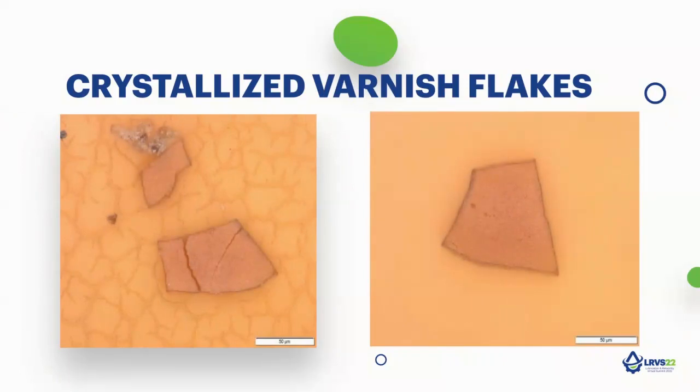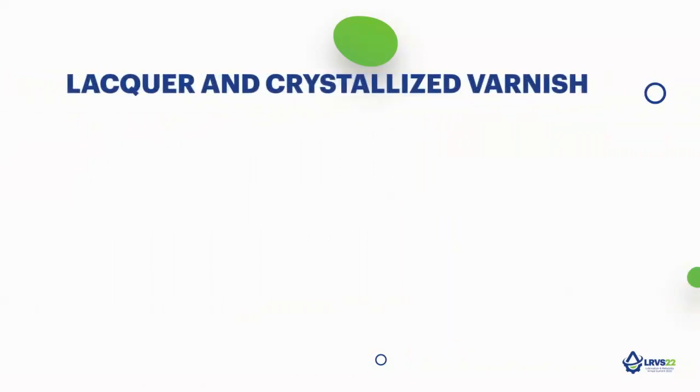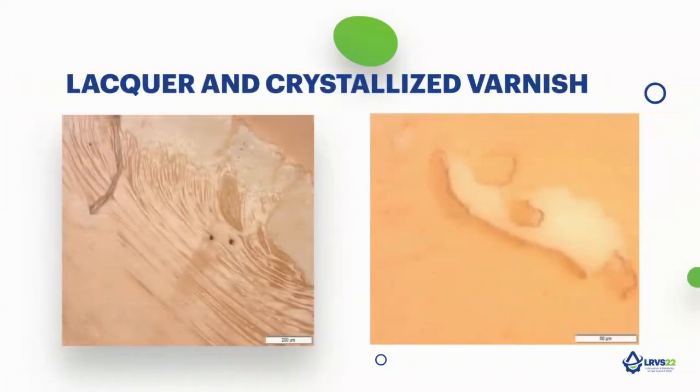As you can see, the image on the left has a very sand-like, desert-like appearance to it. That's an indication of a lot of microagglomerations and sandy-like varnish that's generating into the system, which can lead to filter clogging. And then my favorite, the lacquer-like nail polish appearance. That is the beginning stages of varnish. This is where it would be very easy for you to remove varnish.